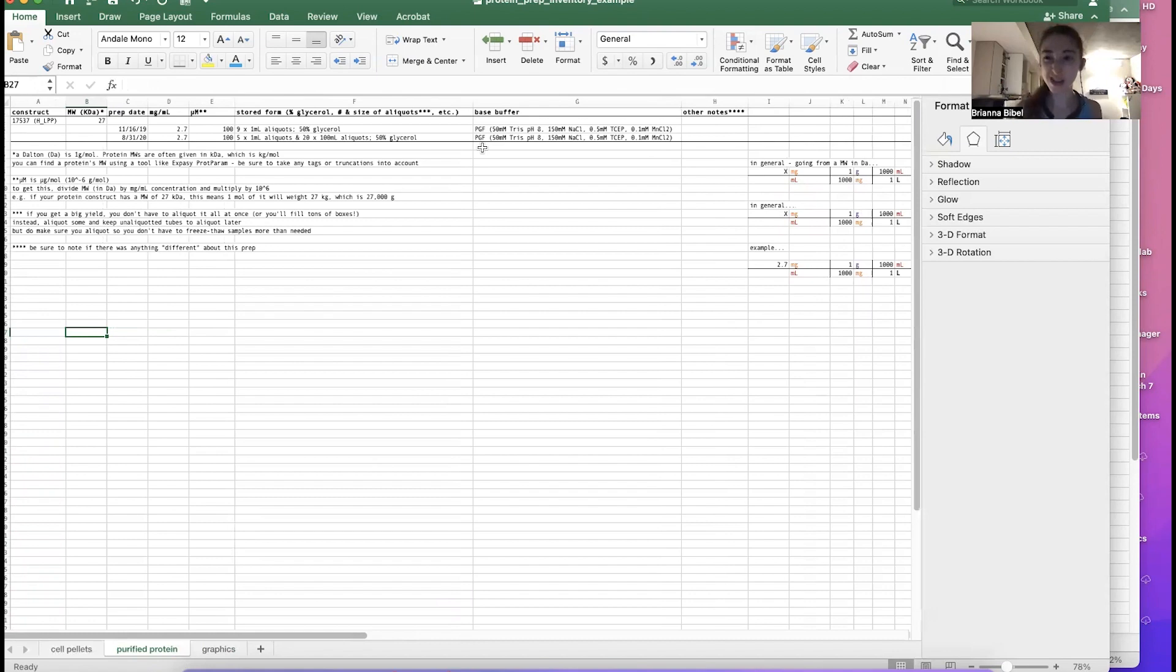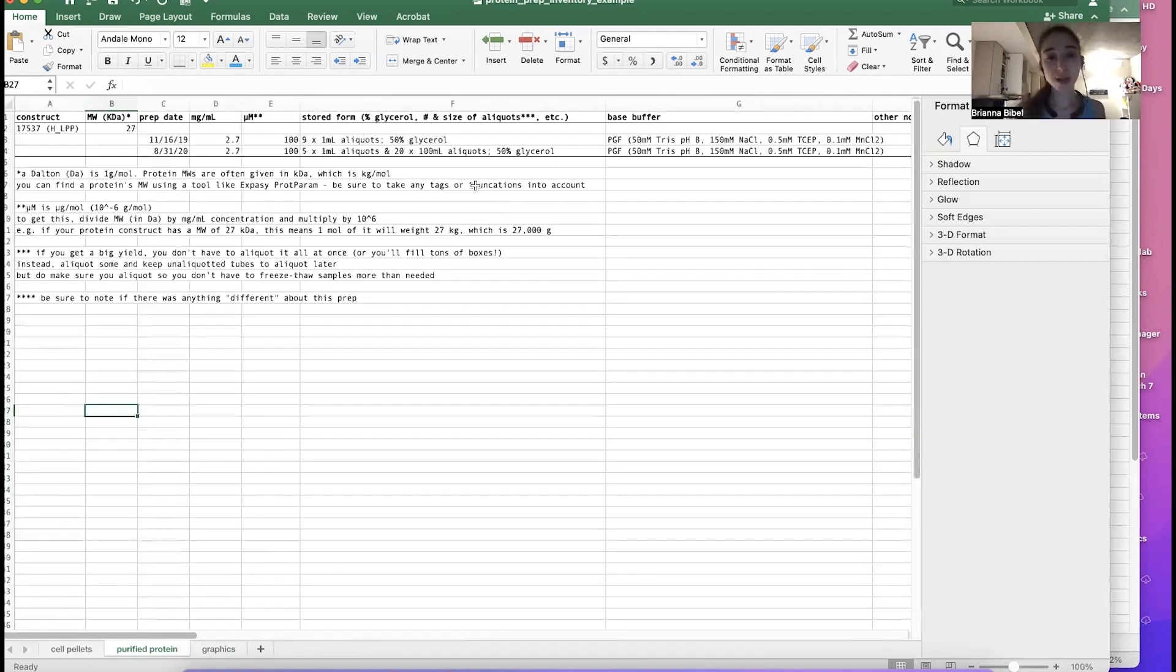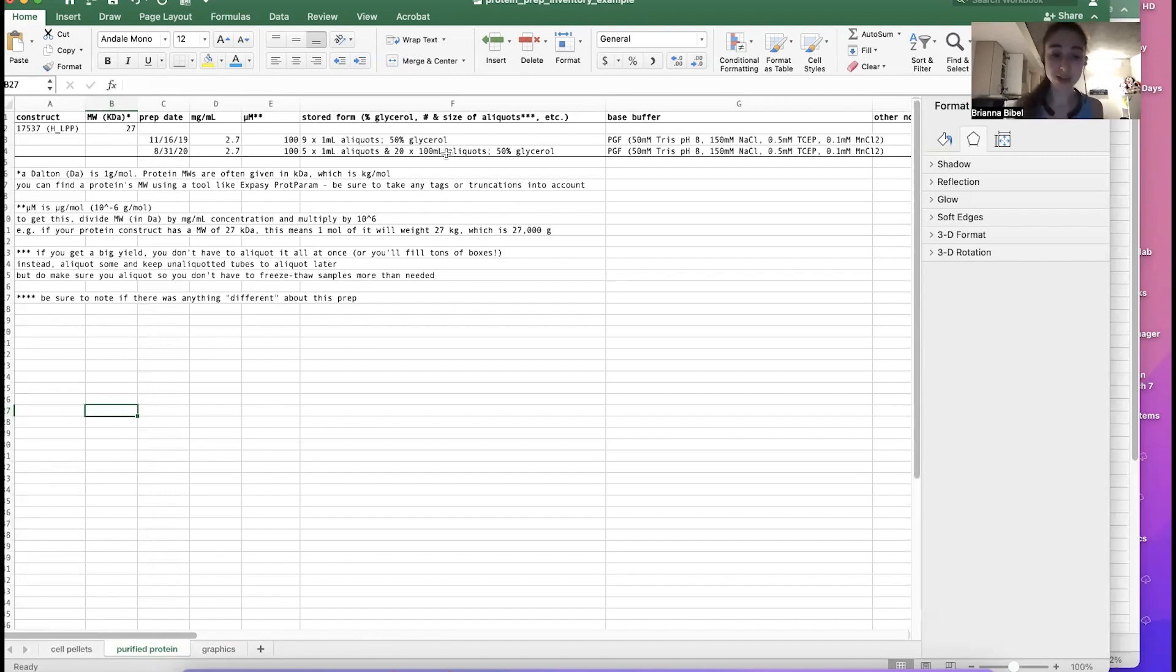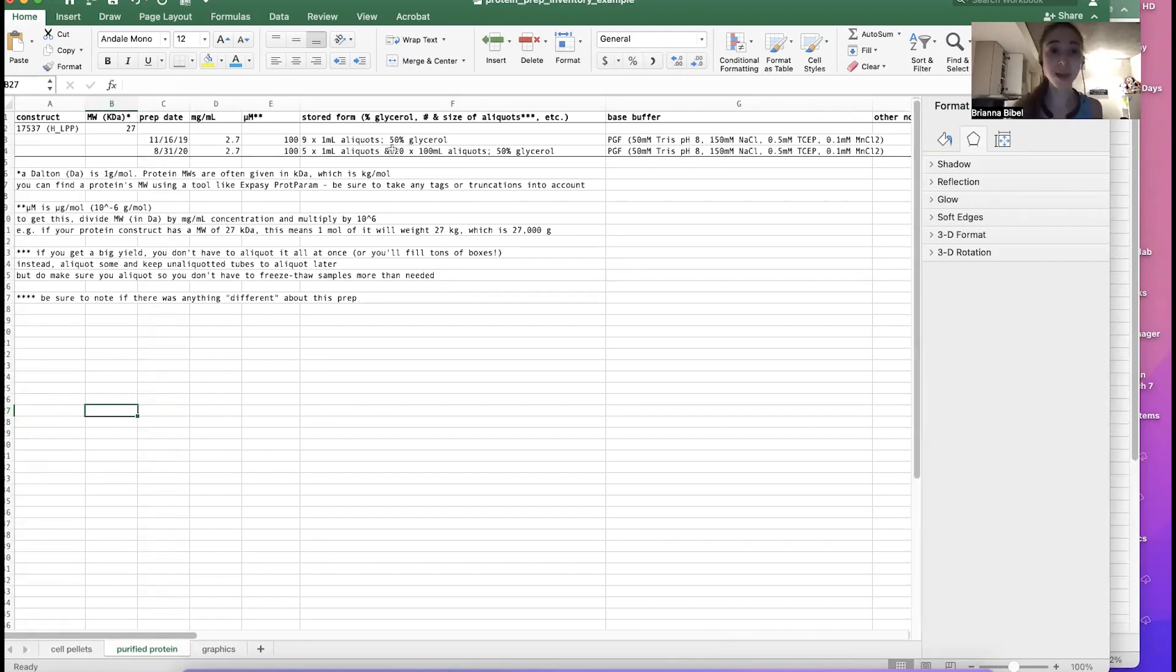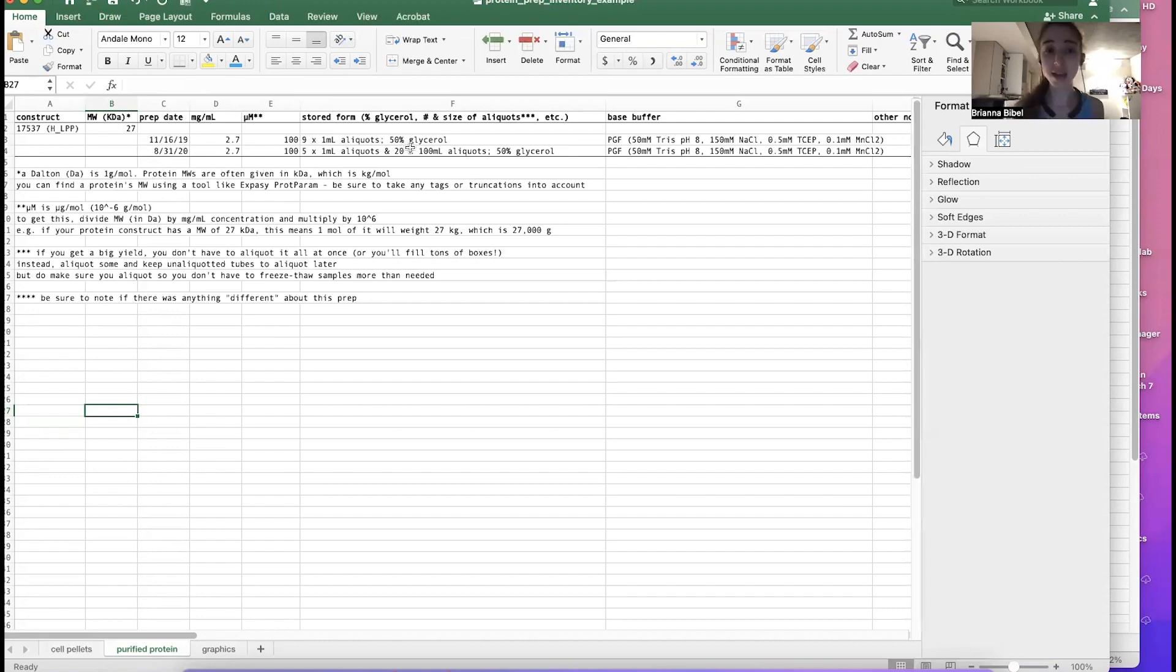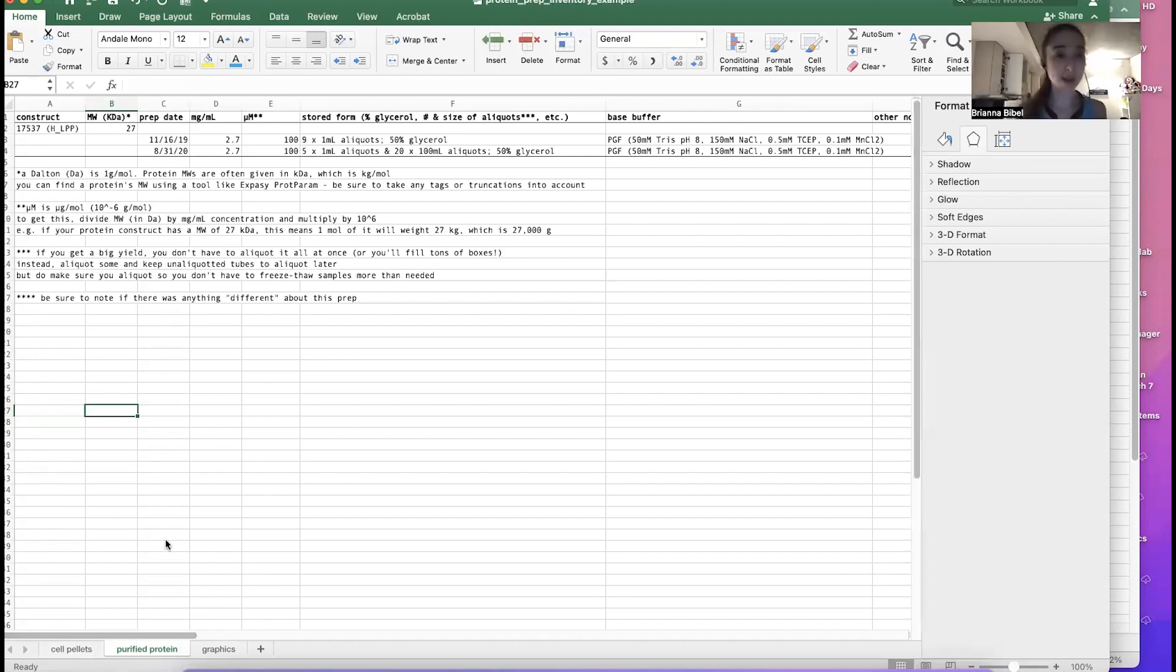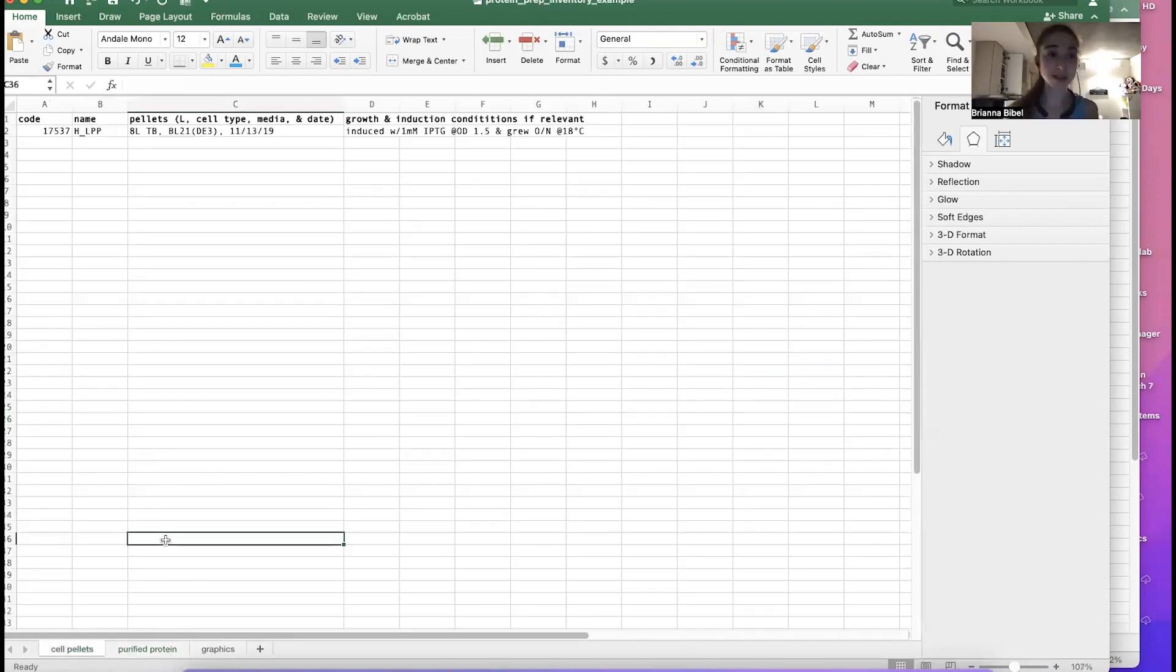And then what I'm going to do is freeze it in aliquots. You want to keep aliquots so that you don't have to freeze thaw too much. If you have a lot of your protein, though, you don't want to make a bazillion little aliquots because that's going to hurt your thumbs and because it's going to fill up a ton of boxes. And so typically what I do is then I make larger aliquots and then smaller aliquots. So the smaller aliquots for those like more, the uses that like a single use type of thing, and then bigger, like sometimes I call these stocks where I have more in the tube and then I can aliquot those out at a later date. Okay, and we'll get back to this in a minute.